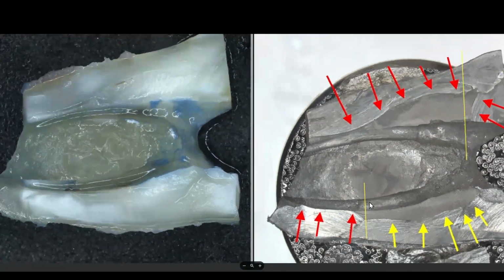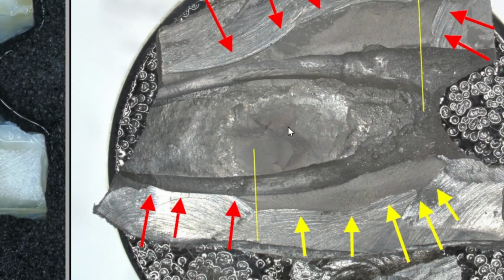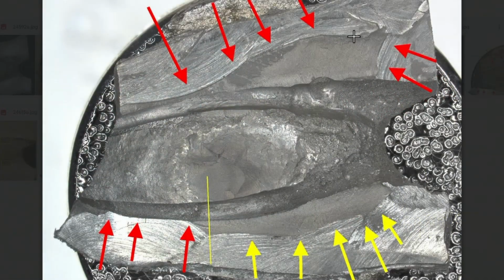Now in the lower area here, you can see this is where the sectioning disc went, and this is probably sectioning debris. Looking at the sputter-coated section makes it a lot easier than trying to look at the wet specimen. I've outlined where I think the sectioning disc went, and now I have a sense of how to choose the areas I want to examine much more carefully. We're going to examine in here because there's probably no sectioning debris, and we can look in here because the sectioning disc was way over here. So this is probably virgin canal as well.